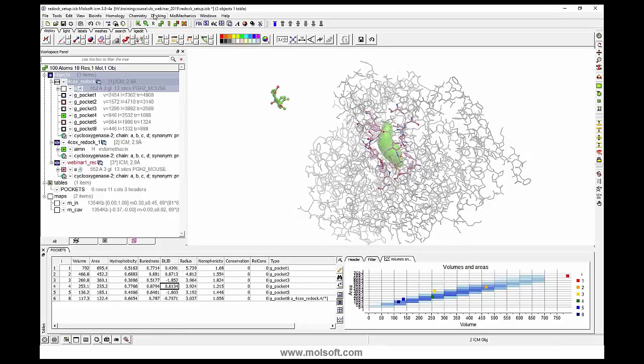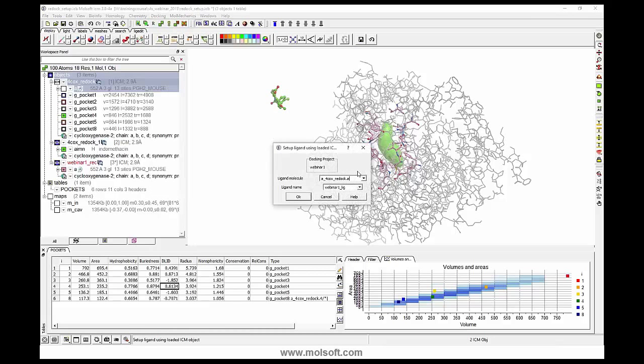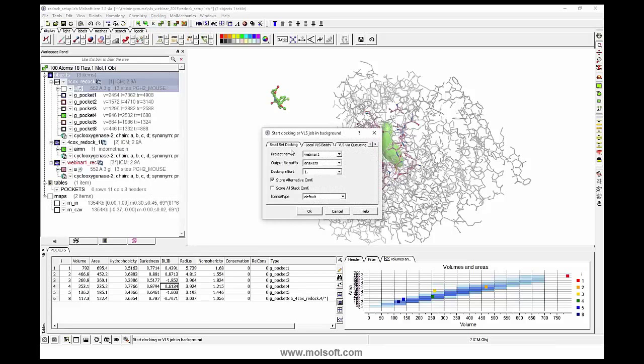So now we have to send the docking running. We go to docking, and we choose set up batch ligand, and there's a variety of options. We're going to use this SDF one in a minute for virtual ligand screening, but we've got a loaded ICM object. The ligand is loaded into ICM, so we just choose that, and the ligand molecule is indomethacin, AIMN for indomethacin. We go OK. Let's set up the ligand. Now we just have to run the docking.